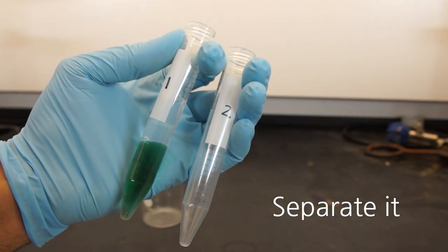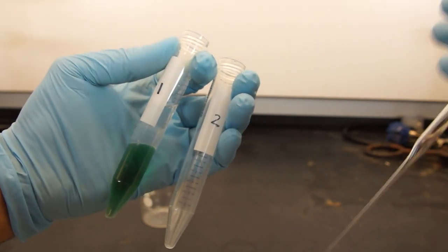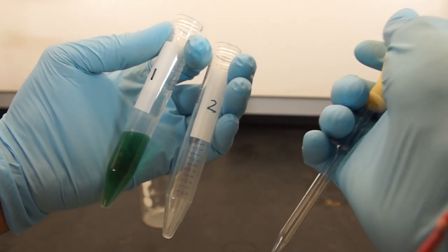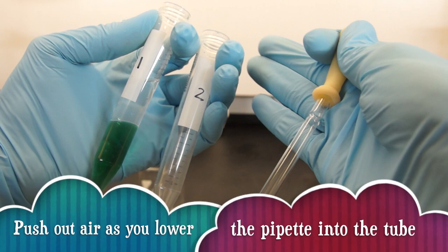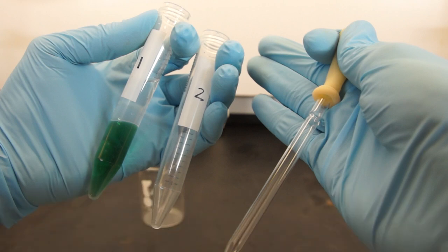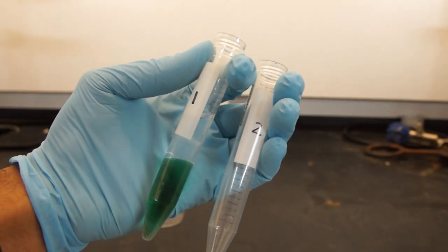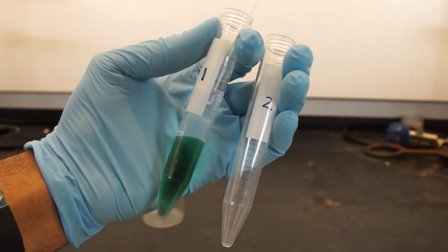To separate layers, grab another falcon tube and a pasteur pipette. Make sure that you push air out as you lower the pasteur pipette into the falcon tube. Lower the pasteur pipette all the way to the bottom of the falcon tube.